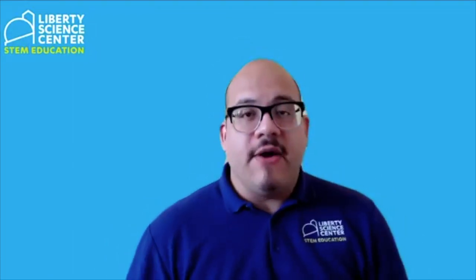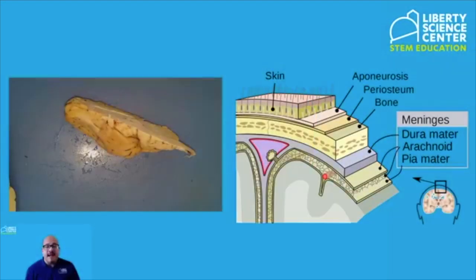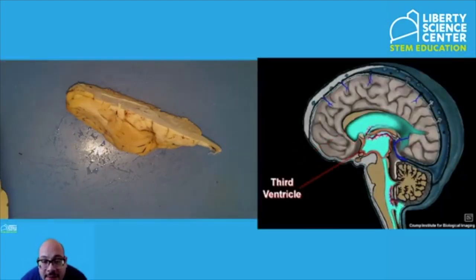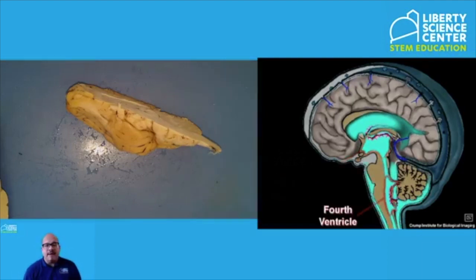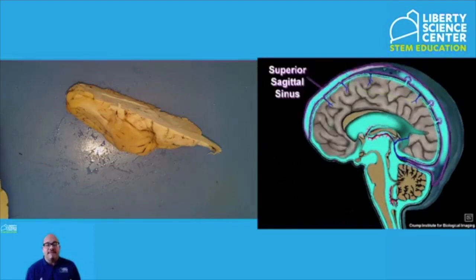Now, these ventricles are openings where what we call cerebral spinal fluid travels throughout the brain. Cerebral spinal fluid is a very clear liquid that helps nourish and provide protection and cushioning for the brain. If you want to see that imaging, we got this really great image from the Crump Institute for Biological Imaging out at UCLA, I think, if I'm not mistaken. They have an imaging that shows us the flow of that CSF, the cerebral spinal fluid.